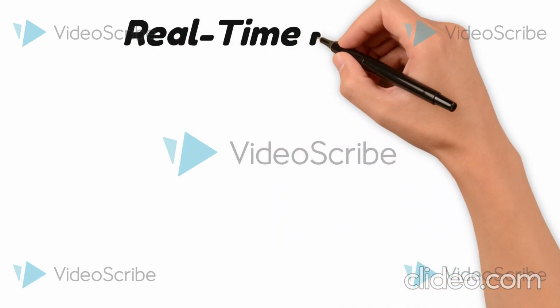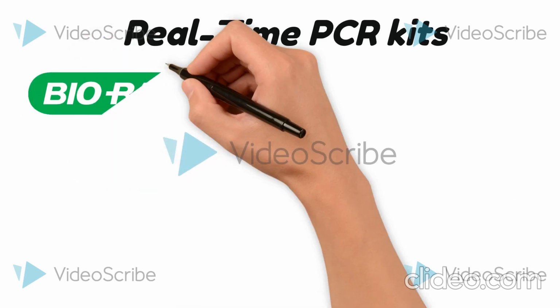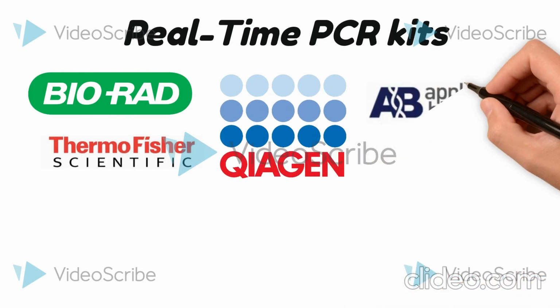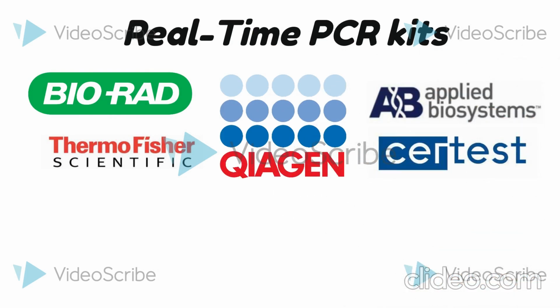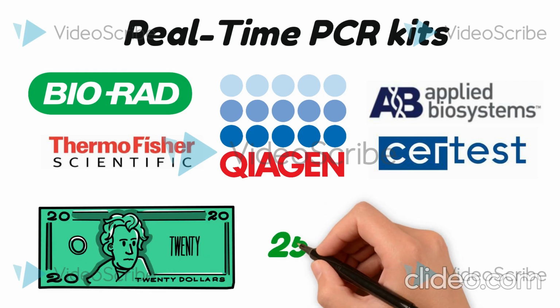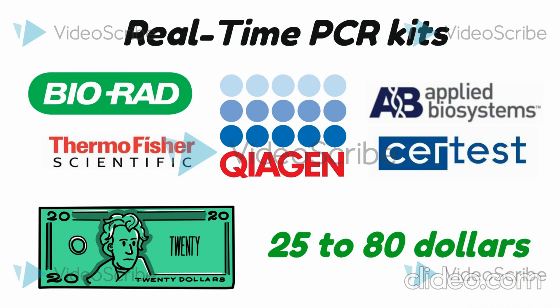Several companies offer real-time PCR kits for Salmonella typhi, including Bio-Rad, Thermo Fisher Scientific, QIAGEN, Applied Biosystems, and Certest Biotech. The cost per test ranges from $25 to $80, depending on the provider and testing scale.